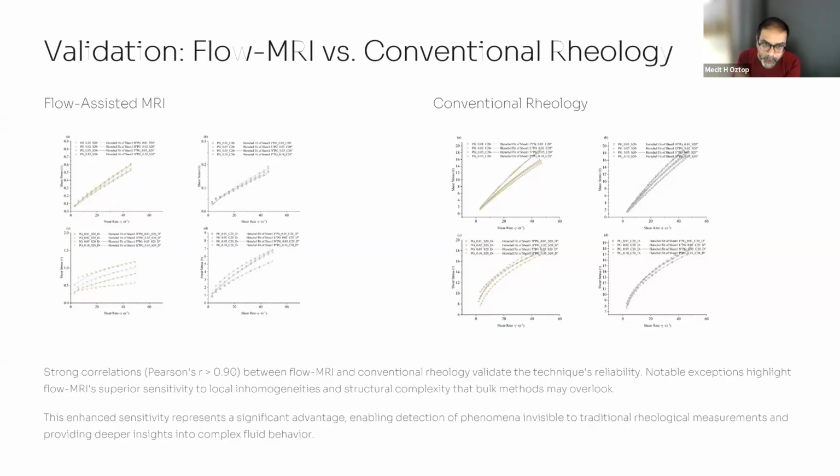And we were able to show that for some of the emulsions, some of the hydrocolloid combinations that we tested, in fact, experienced that rheological flow behavior change, and we were able to quantify it through our flow MR system. So that's all I want to talk about. Thank you, and I can take your questions if you have.